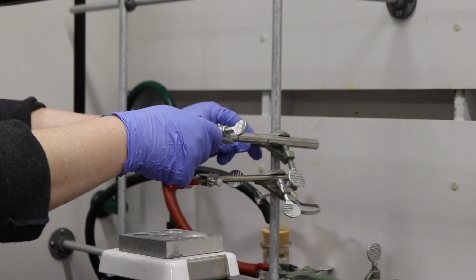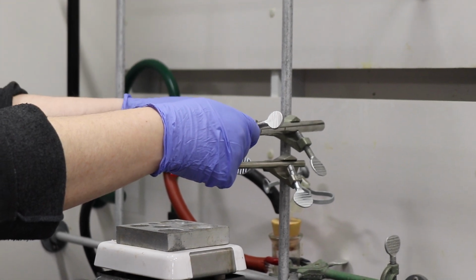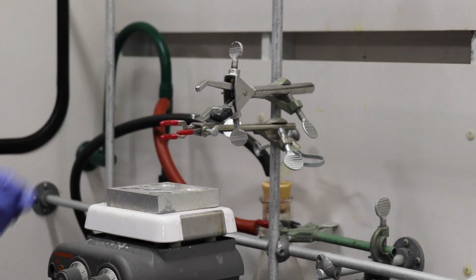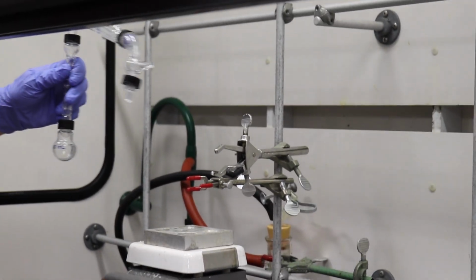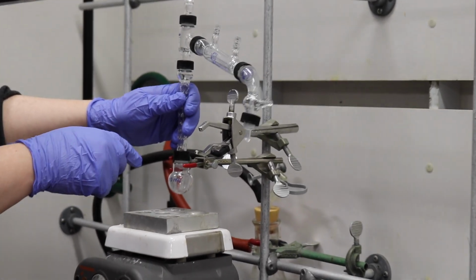here. Now we have to set up our clamps just as we had done in our simple distillation. We have to make sure they're secured to the back of the hood. Now we take our system, our skeleton system, and you can see we're going to take our system and we clamp back our round bottom.